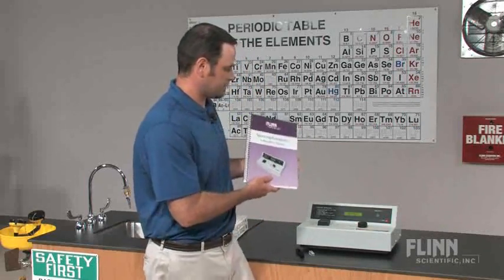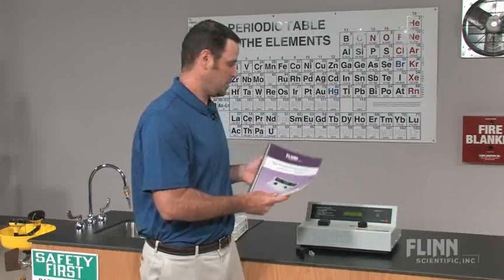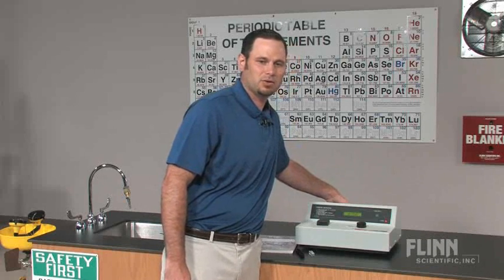It comes with the Flinn Scientific spectrophotometer guide that has 14 time-tested experiments. You can also interface this unit with your computer with the USB port in the back of the unit as well.